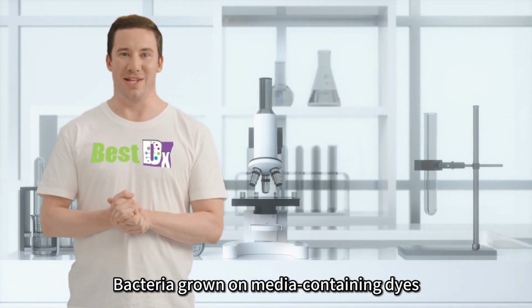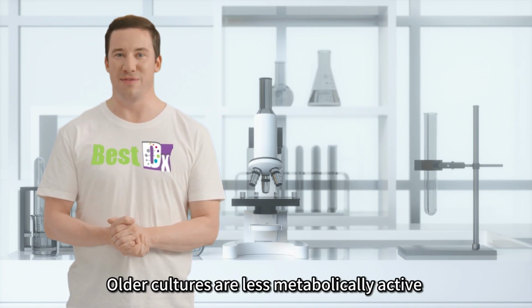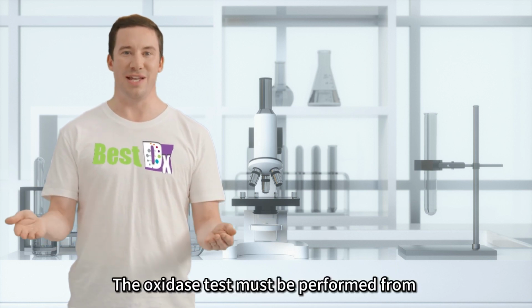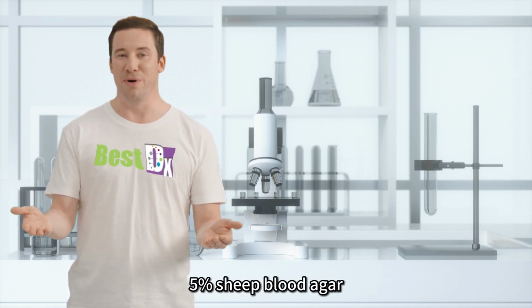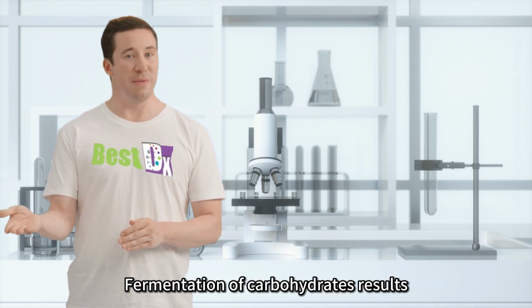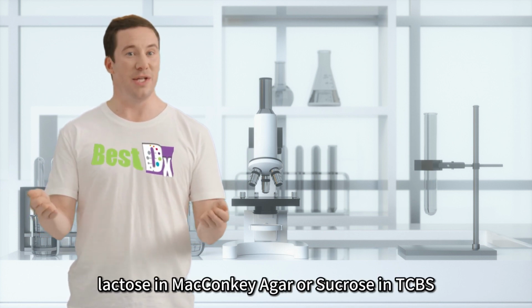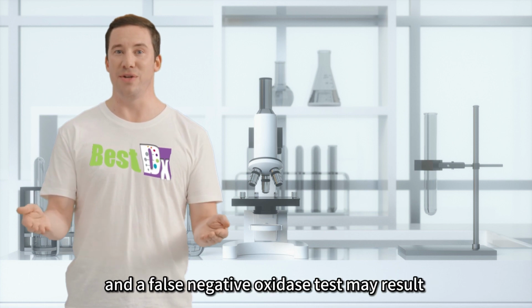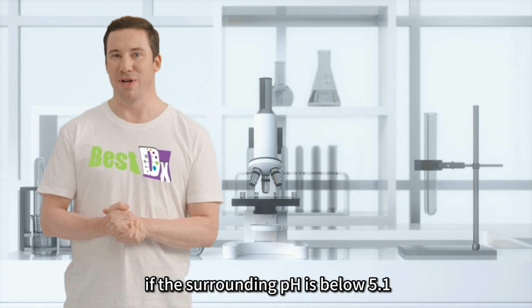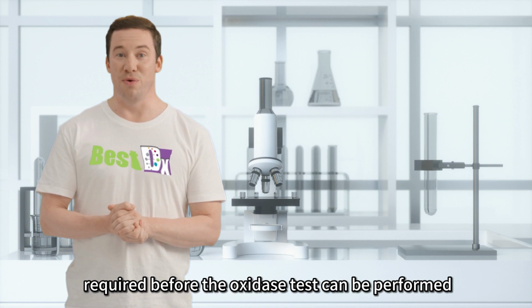Bacteria grown on media containing dyes may give aberrant results. Older cultures are less metabolically active, so may give false negative results within the mentioned observation time. The oxidase test must be performed from 5% sheep blood agar or another medium without fermentable sugar. Fermentation of carbohydrates results in acidification of the medium, e.g. lactose in MacConkey agar or sucrose in TCBS, and a false negative oxidase test may result if the surrounding pH is below 5.1. Subinoculation on nutrient agar is required before the oxidase test can be performed.